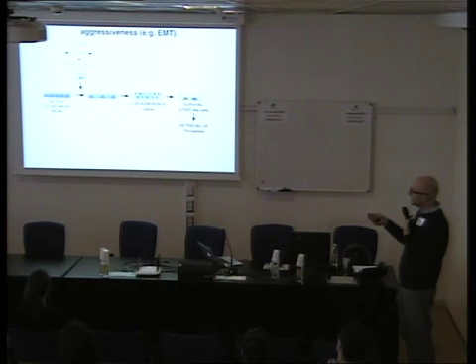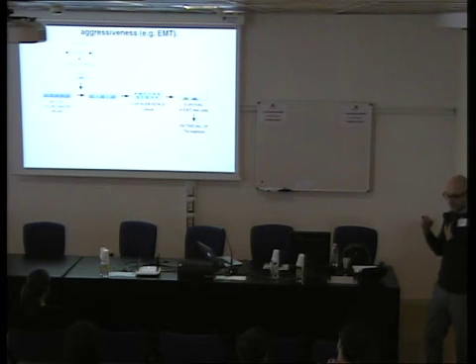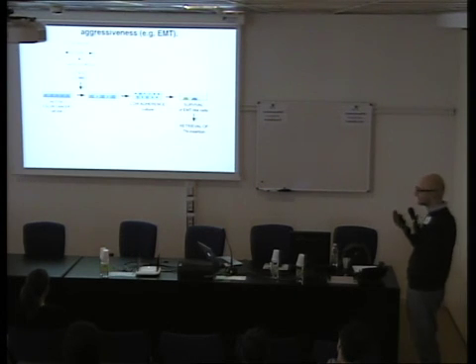So after you transfect the 2 plasmids in the cells, you get cells that are green. And after keeping the cells in a low adherence culture, most of the cells die, some cells survive. And those that survive are EMT-like, so epithelial-mesenchymal transition-like cells.